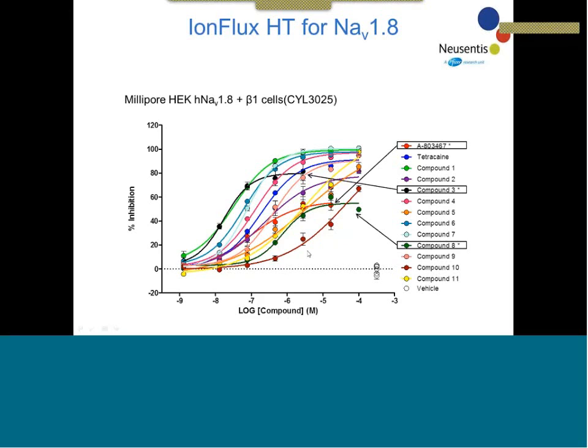Now there is a way that with the latest version, the latest software version, that I think Ali is going to talk about, you can stack your voltage protocols, so you could introduce perhaps a resting state voltage protocol for the wash-off, and then go back to your inactivated state for compound application. So it's something that's on the list of things to do. But I think overall, and I hope you agree, the data quality is pretty good. So I'm showing here averages and standard deviation from 4 experiments.